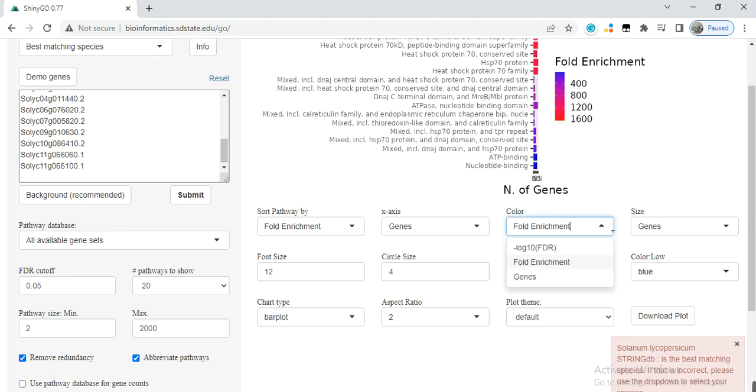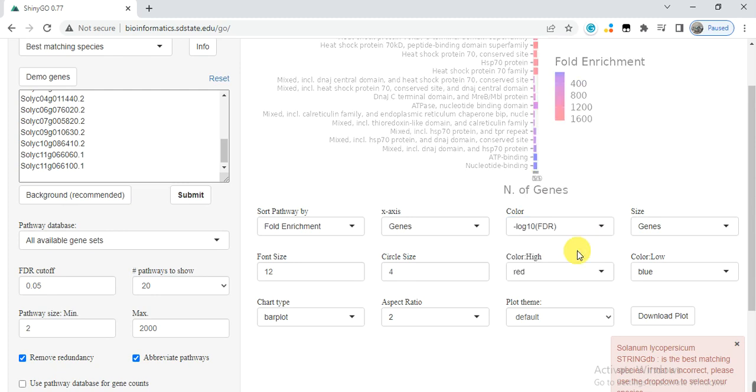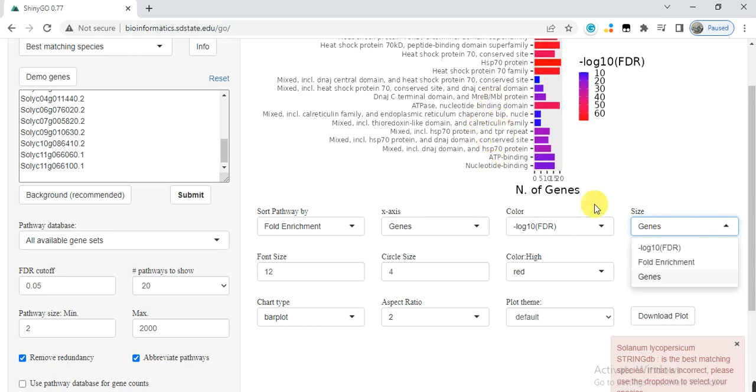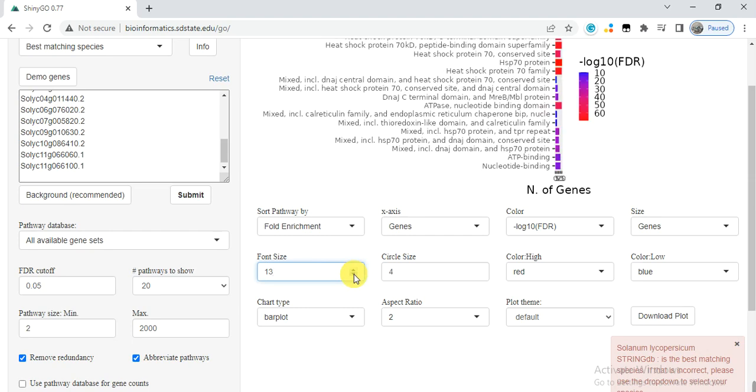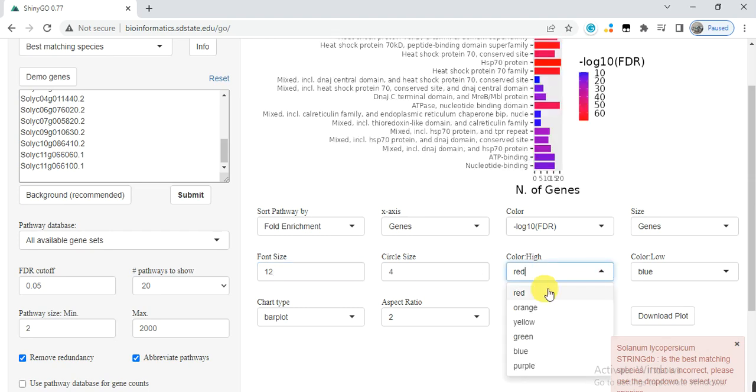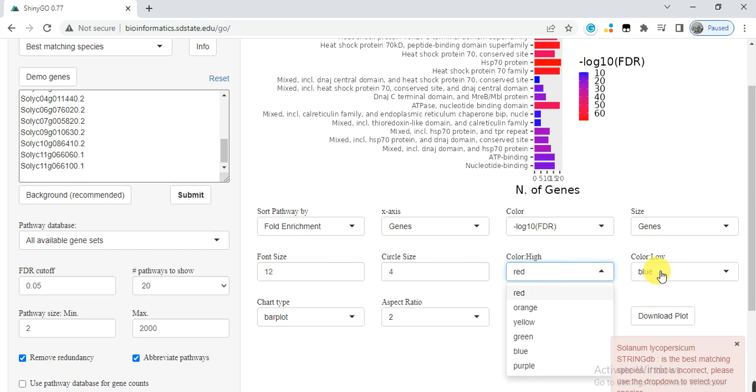You can change the color accordingly. You can change the size of the genes, and here is your font size.